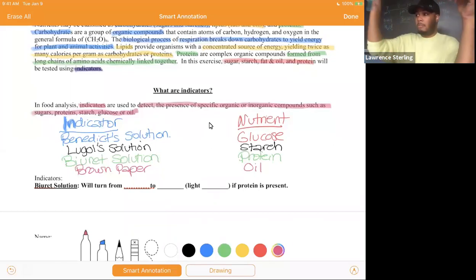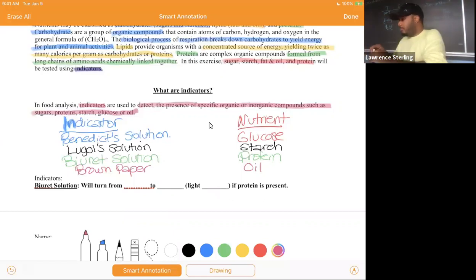So I know you can't see it, but I actually have a hot plate on with a beaker filled with water that's boiling or about to boil. And we're just gonna let that sit in there while we conduct our other tests, okay? So we're gonna wait on the results of that test and see if it actually tests for the presence of that.